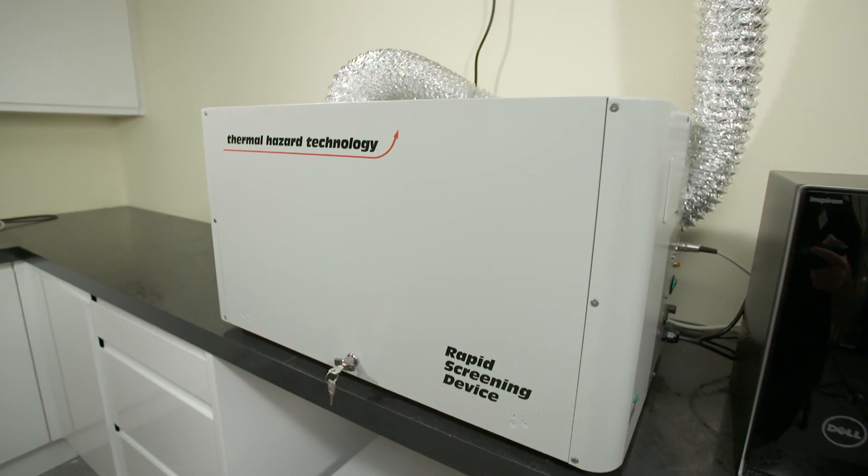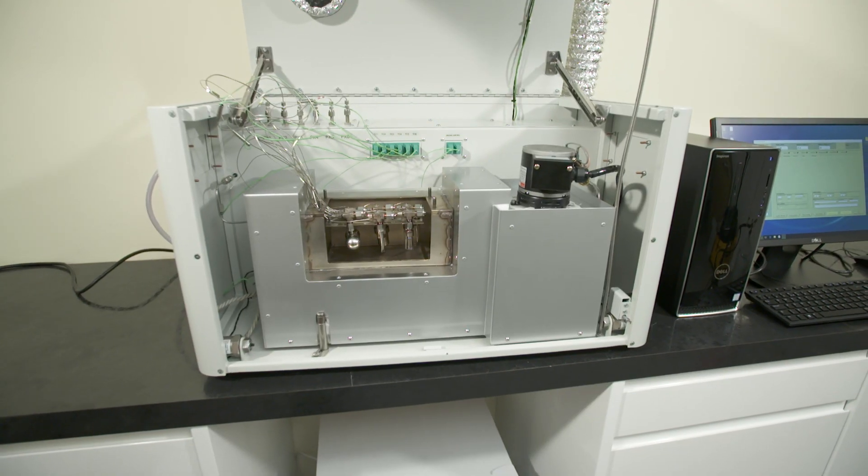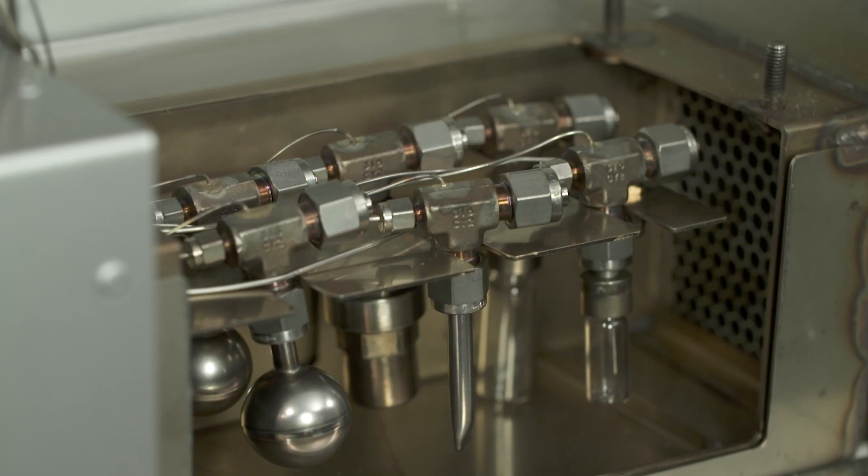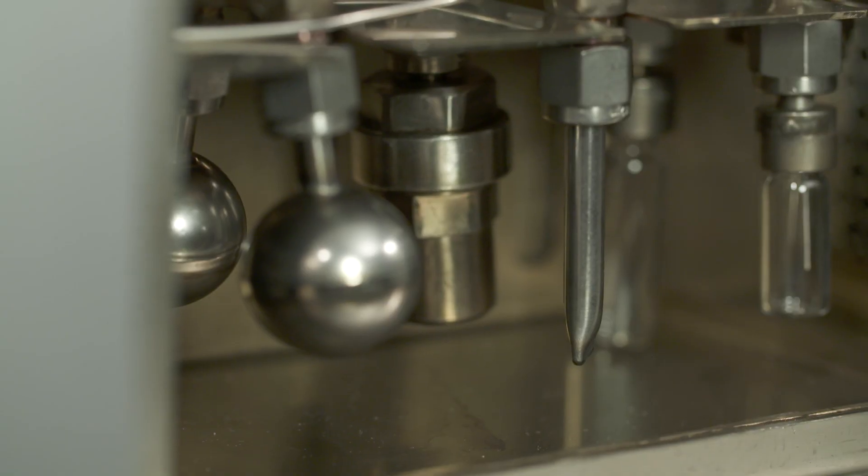The Rapid Screening Device or RSD is a unique safety calorimeter that allows measurement of temperature and pressure on up to six samples concurrently.